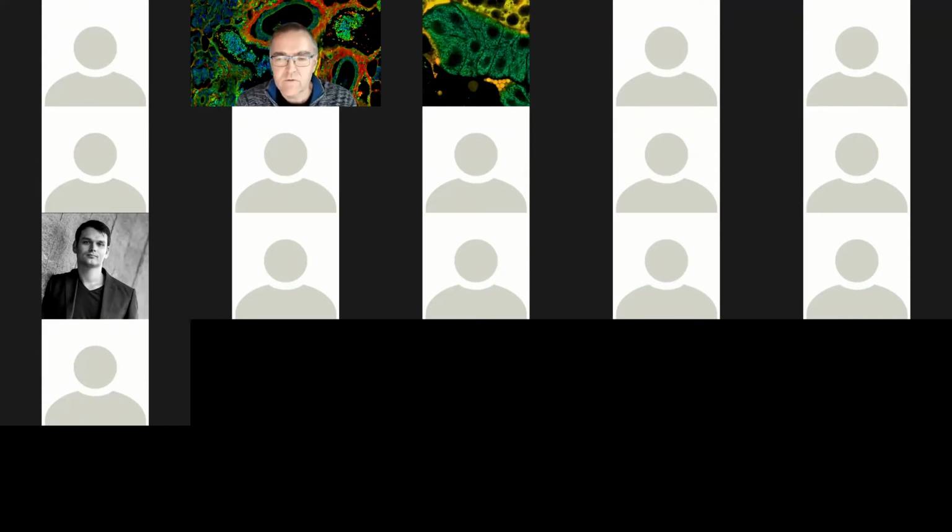In the experiments with NADH that you're usually doing, is it really important what the actual lifetime is, or is it mostly comparing before and after doing something? In my experience, the systems actually differ a little bit in which lifetimes you calculate in the very end. So yes, it's rather a comparison of treated and non-treated samples in your experiment. Depending on how your system is set up and calibrated, I don't think one should compare absolute lifetimes.